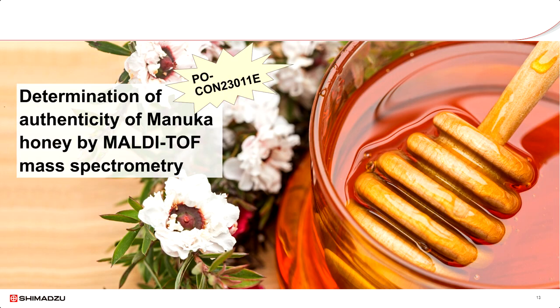The second application I will present today is on the use, for the first time, of MALDI-TOF MS to determine the authenticity of Manuka honey. This work was presented at the ASMS 2023 conference.